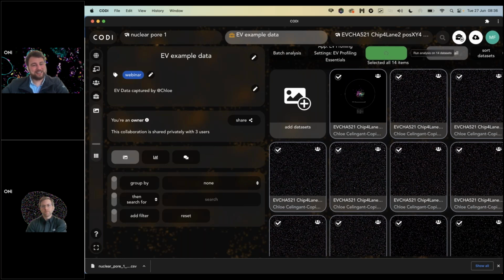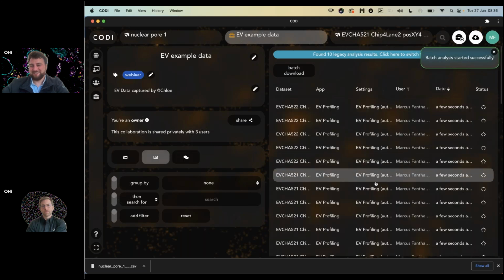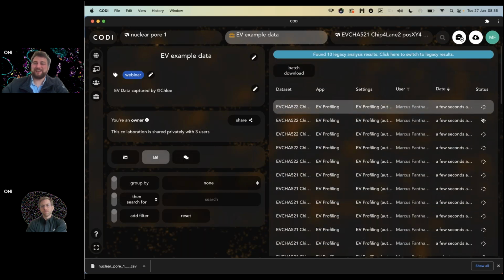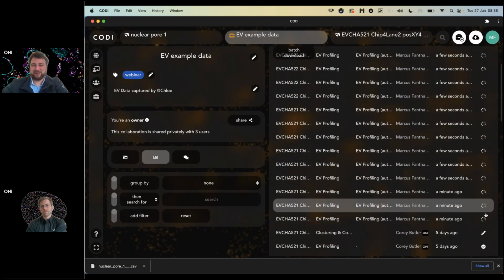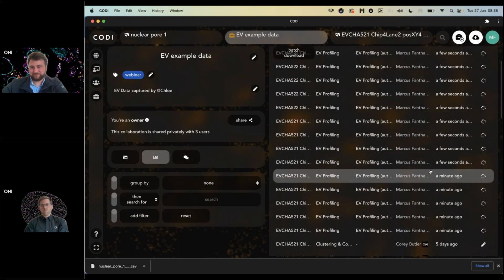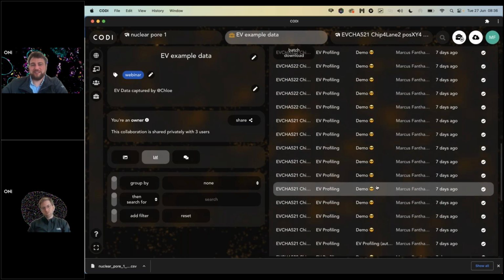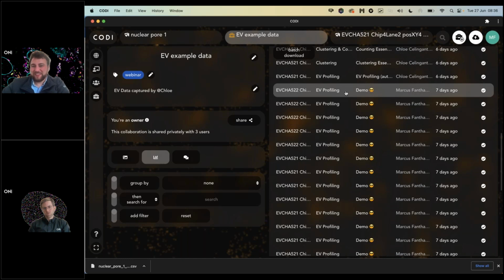This might take a little while, so here's one I prepared earlier. Firstly, we can see all those analyses that I just started up running. This is the analysis results section of the collaboration. Further down, we have some that I ran 7 days ago.